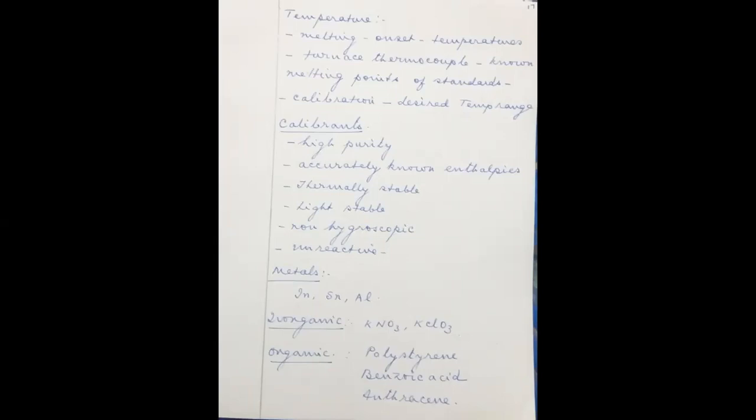I have already told you what hygroscopic is. Hygroscopic means which can absorb moisture and become very sticky. It is also called deliquescent, and opposite to deliquescent is efflorescent, the substances which lose their water content and become dry. And then it has to be unreactive. So these are all the important characteristics of the calibrants used in differential scanning calorimetry.